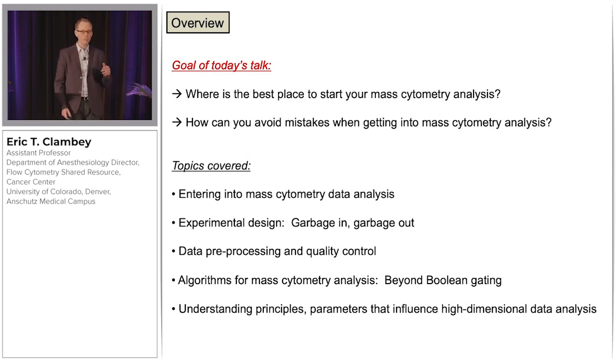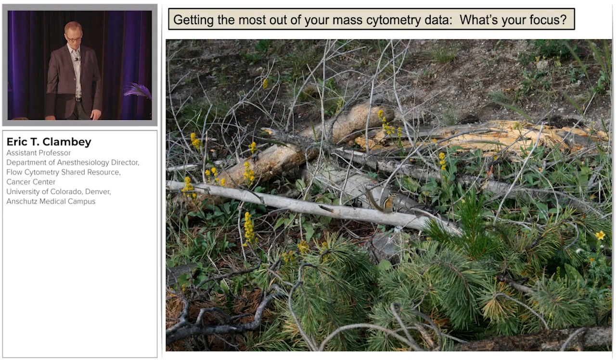Okay, so I have two goals for today's talk. First, where's the best place to start for your mass cytometry analysis? And second, how can you avoid mistakes when getting into this type of analysis? We'll discuss a range of topics from experimental design to parameters underlying your high dimensional data analysis.